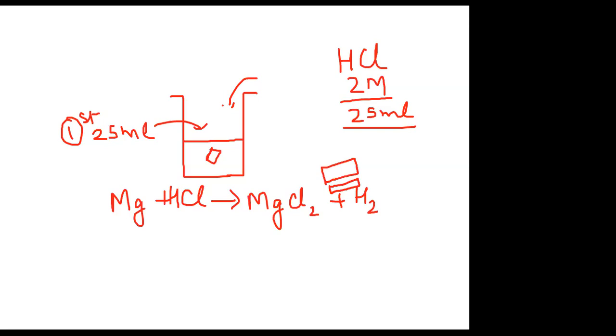You note the time. This is the first experiment that you have carried out with the undiluted acid that was provided to you, and the time is noted. I will show you how to prepare the table afterwards to note down the timings. Now, in the next experiment, you can throw the solution from this beaker away and get ready for taking the next reading.